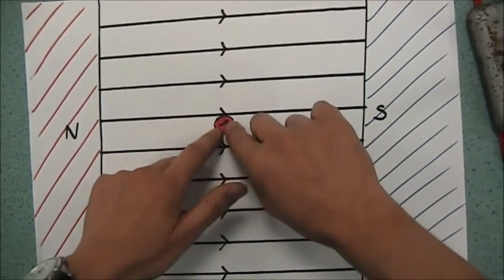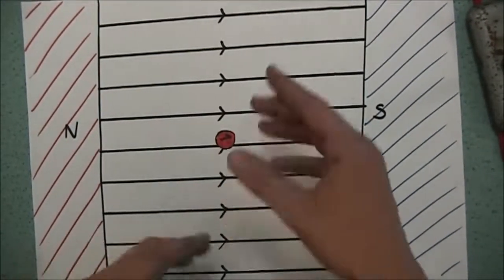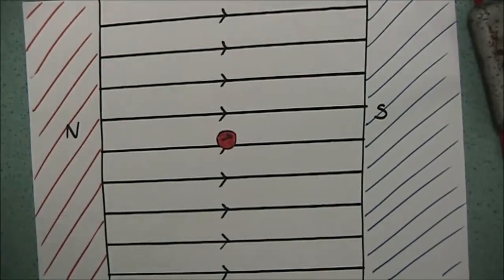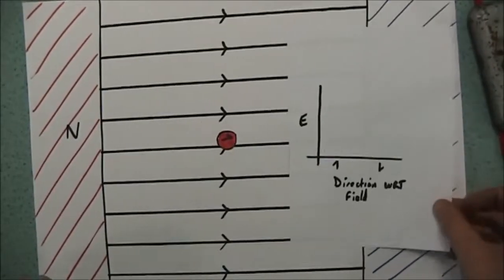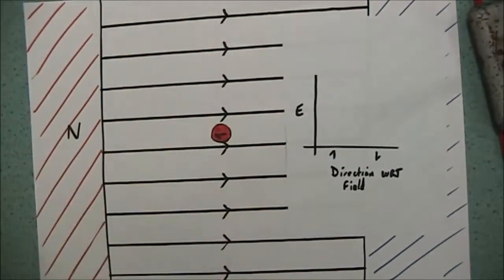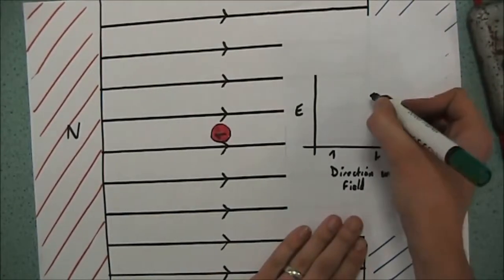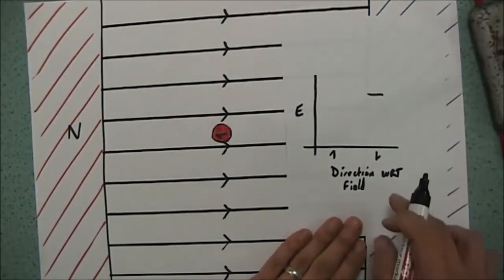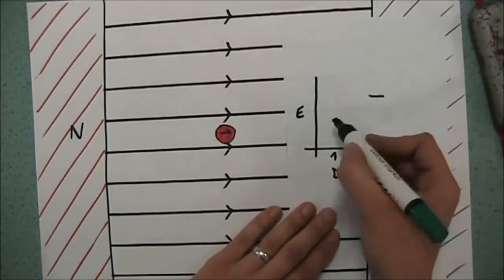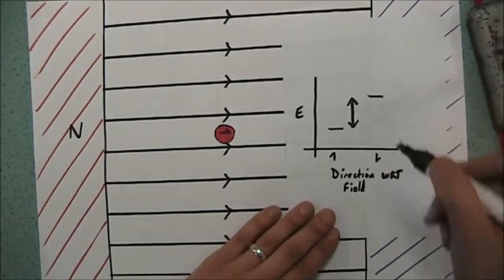Don't tell any physicists I said wobbling. But what's happening here is we are getting a kind of oscillation, and we can measure how much energy we get from that. So if I have my nucleus aligned against the direction of the magnetic field, then we have a high amount of energy. If it is aligned with the magnetic field, then we have a lower energy. And so the difference in energy there is what we're going to measure with NMR.